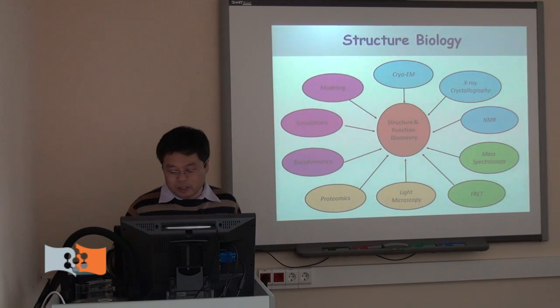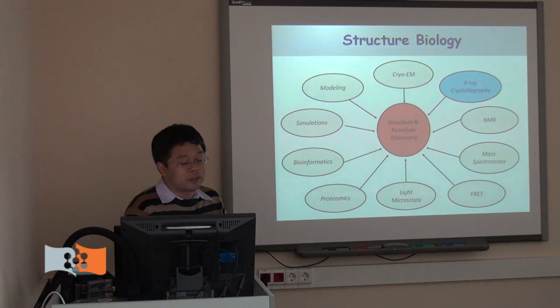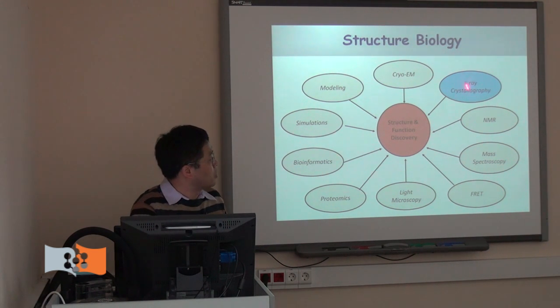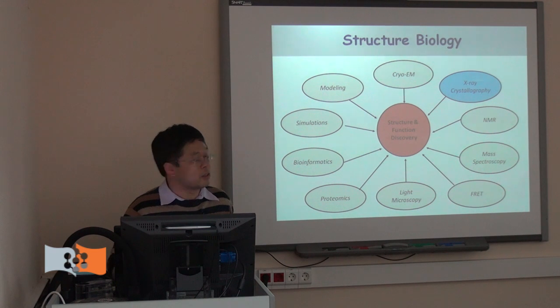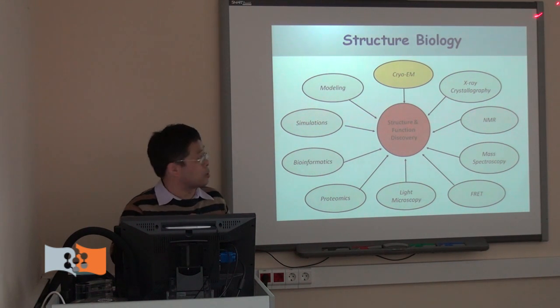Basically, the most important and most popular method in structural biology is X-ray protein crystallography. Tomorrow, Professor Liu will give the introduction about this method. So today, I will focus on the cryo-EM electron microscopy method.